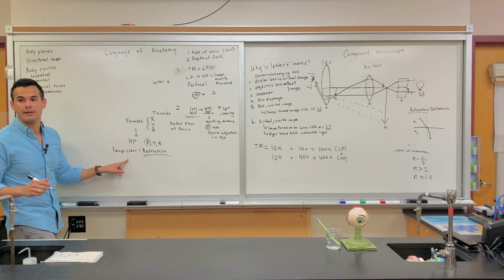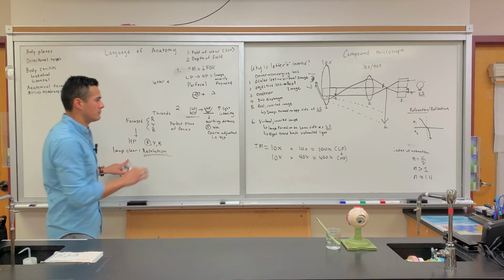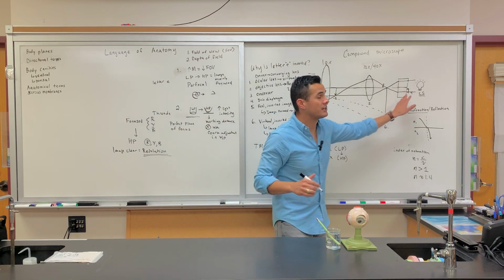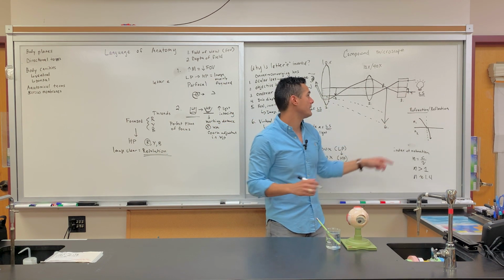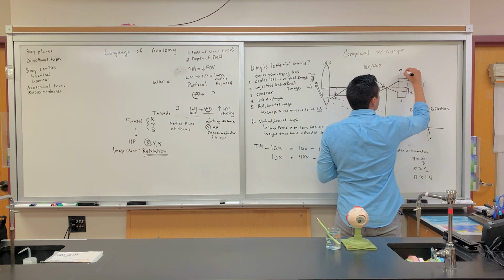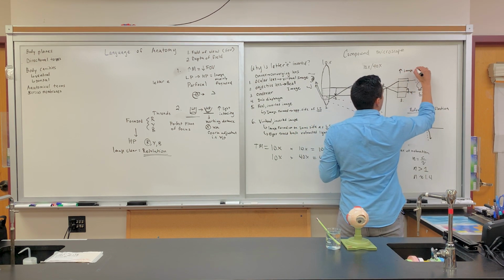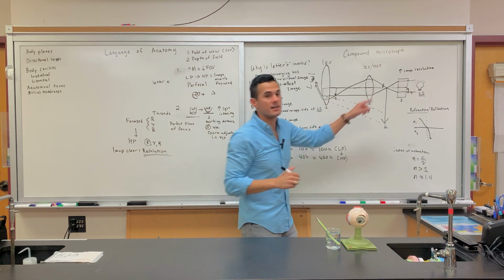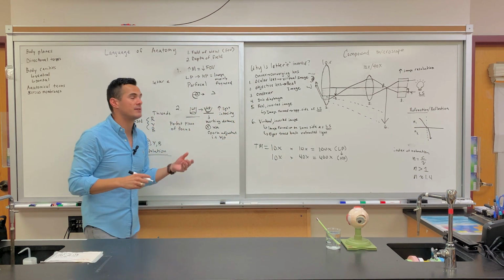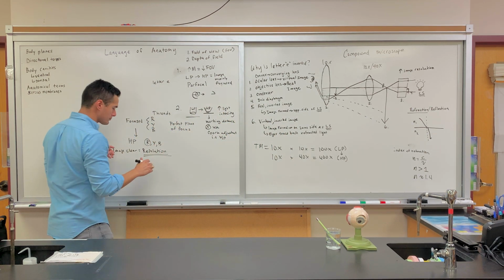Resolution means image clarity. Just to go back here, the condenser not only concentrates the light, but it also increases the image resolution, because it's concentrating that light while also improving the image at the same time, okay?